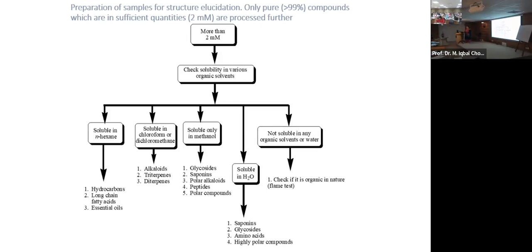So if you do not want to use a deuterated solvent, or you cannot afford it, you have to use a solvent that doesn't have hydrogen, like CCl4. Otherwise you will not be able to see the signals of your own sample. Got it? All right.